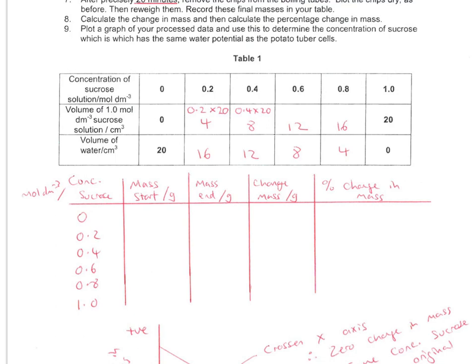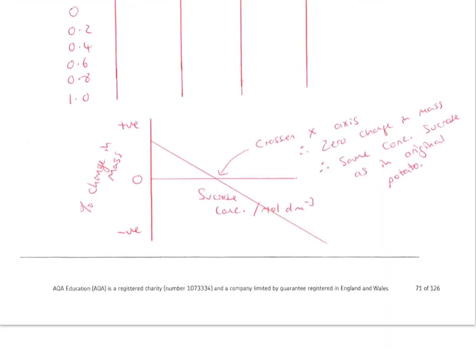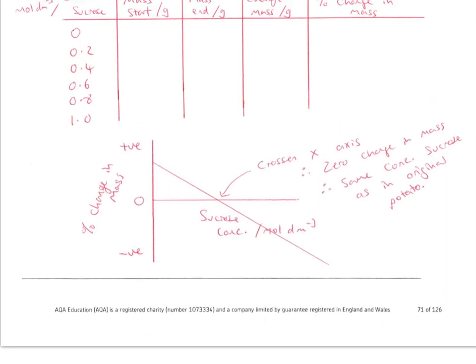After you've done your serial dilution, and you've got your potatoes in for 20 minutes, you then need to draw a results table. So the independent variable goes in the first column, so concentration of sucrose, and the unit should really have gone after the slash, so moles per decimetre cubed. So our known concentrations. The mass of the potato at the start, mass of the potato at the end, the change in mass, and the percentage change in mass. It's really important you have percentage change in mass because each of the potatoes would have had a different mass at the start. So this is what our calibration curve would look like.